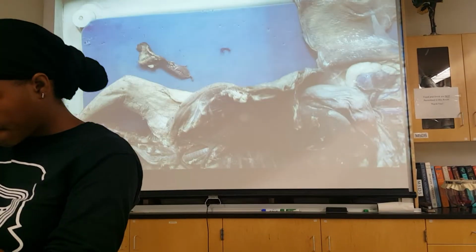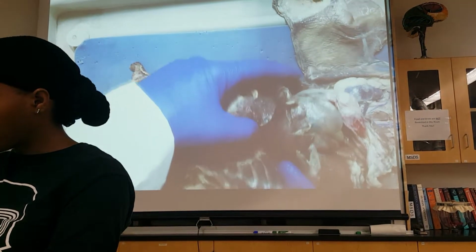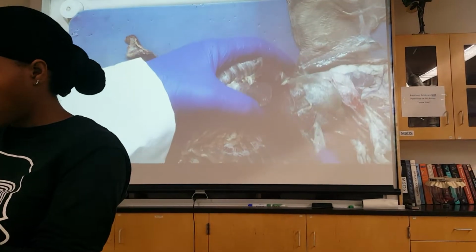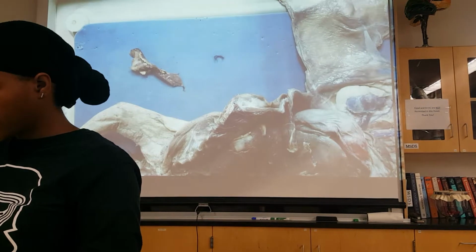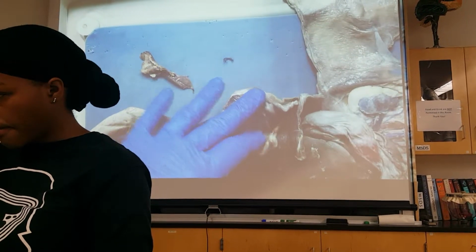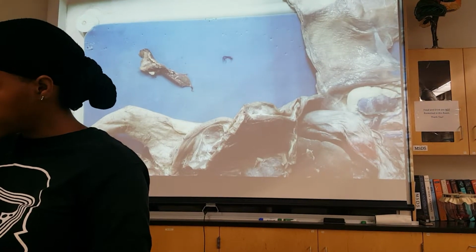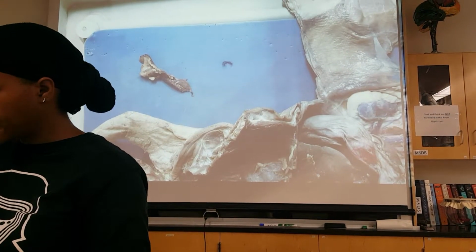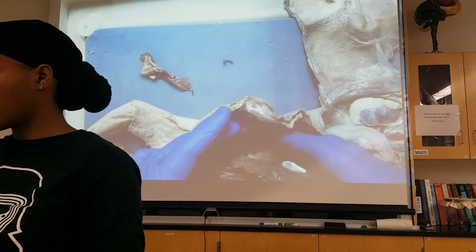When you do your blood vessel lectures with page 116, one of the systems there will be this azygos system. And it's a little more complicated in a human than it is here in the cat, but same principle, it's draining the body wall. So there are 10 veins then here in the thoracic cavity that you should be able to identify. Good? Okay, then arteries.